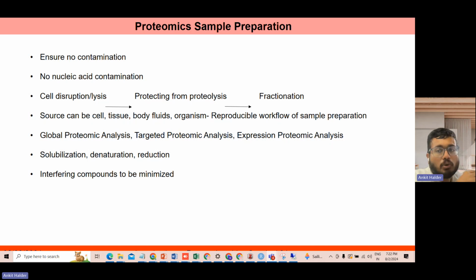The second point is very important: with mass spectrometry-based proteomics also, if we have this kind of protein fractionation, then the masking problem, where less abundant proteins get masked by the presence of more abundant proteins, can be relaxed. So it is quite important to add this step, which is not necessary, but it helps improve the yield of proteins and to understand and interpret them in a better way.